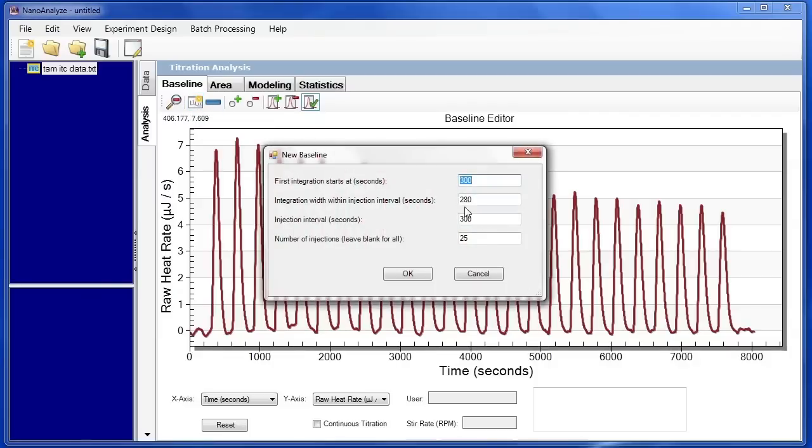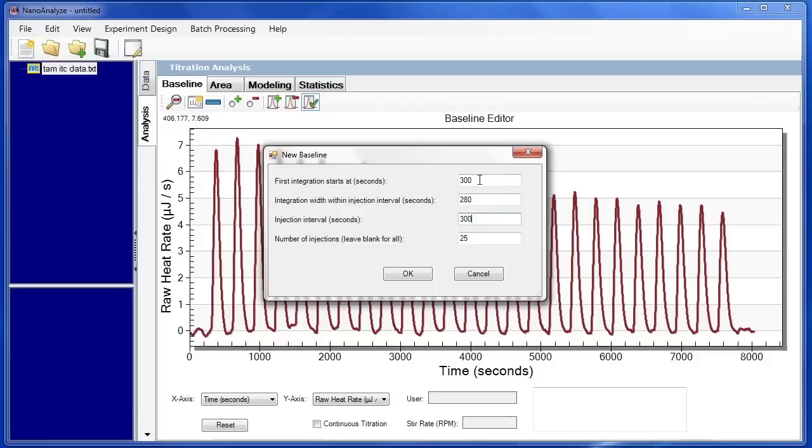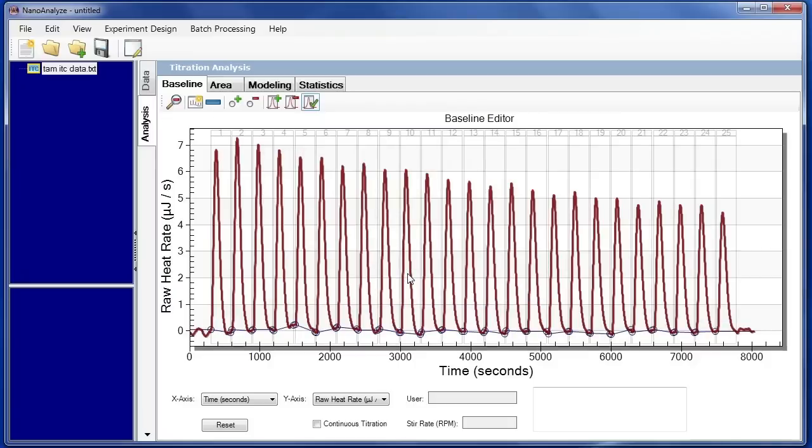These are where the numbers of the 5 minutes, or 300 seconds, come important. Because these numbers will have to be manually added into NanoAnalyze. So we have 5 minutes before the first injection. Each injection occurred every 5 minutes. And we're going to only integrate 280 out of the 5 minutes. We know that there are 25 injections, or we can leave this blank. But for us, we'll put in 25 injections. Now click OK. And a baseline has been created.